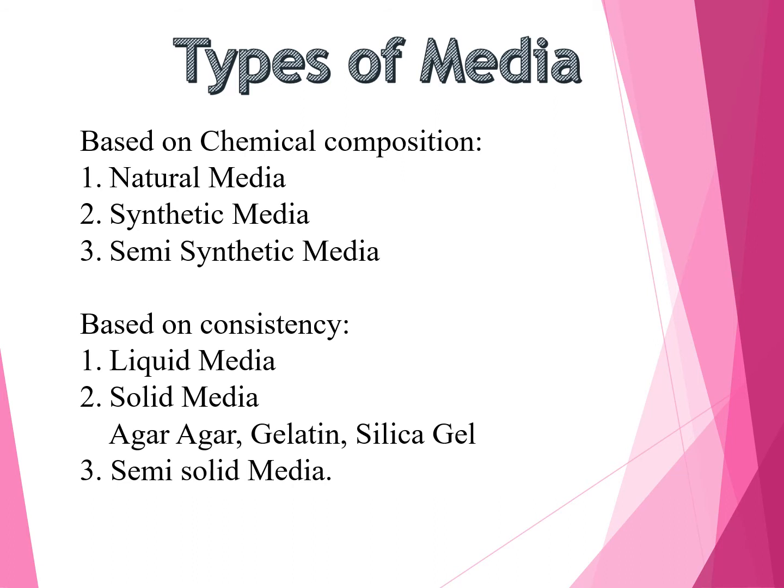First one is natural media, next is synthetic media. As the name suggests, in natural media the exact chemical composition is not known, like carrot agar, oatmeal agar, rapeseed agar, etc.